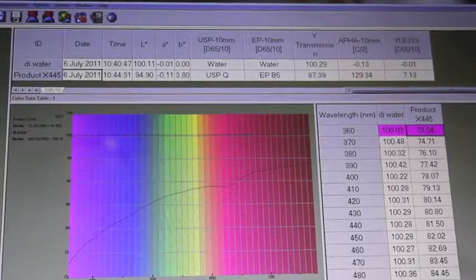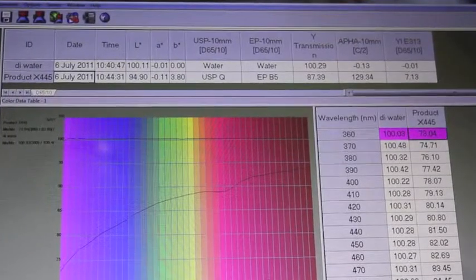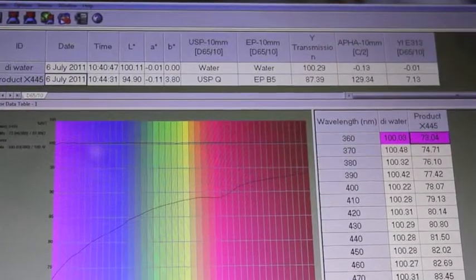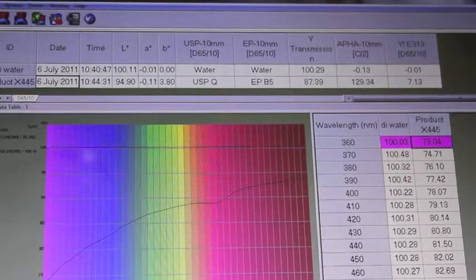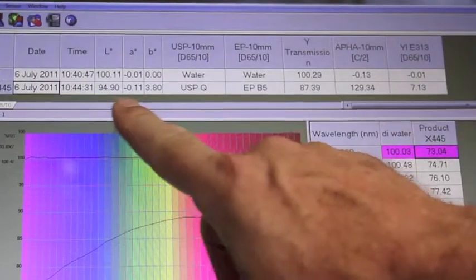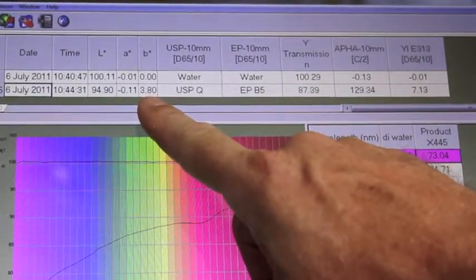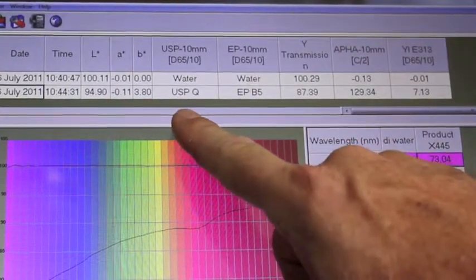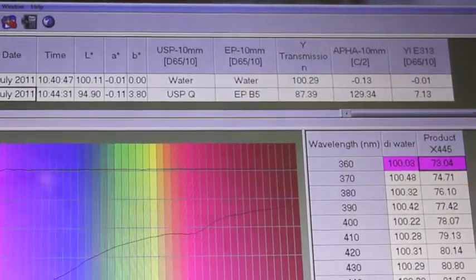In our first reading, I read the DI water back as a quick operational check, and it verified it as water with 100% transmission. I then measured our sample, and it came back with a lightness value of 94, a yellowness of about four units, and the corresponding USP and EP values.